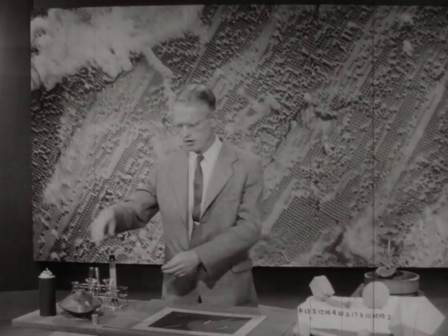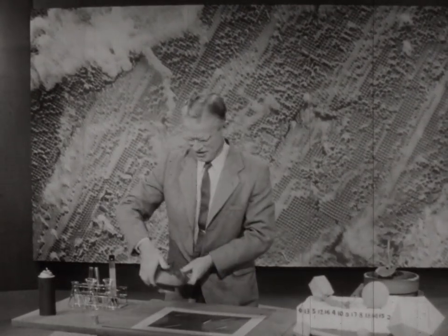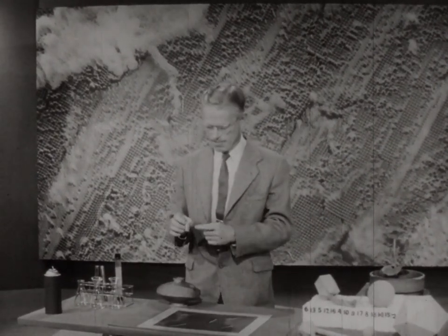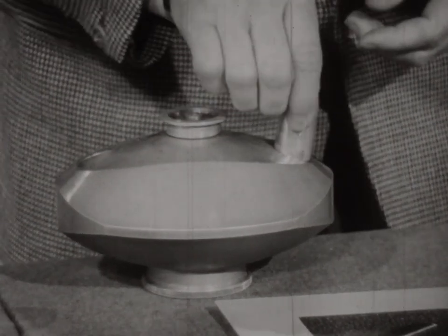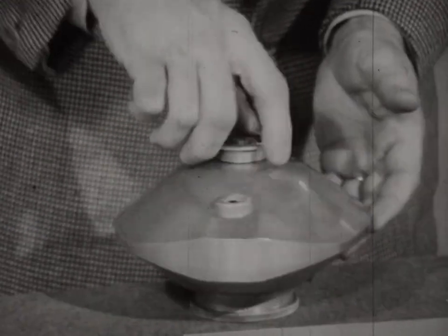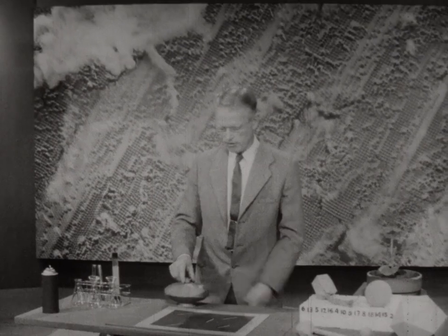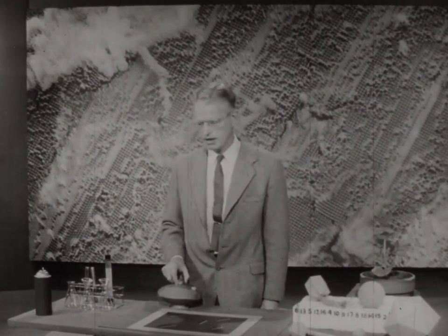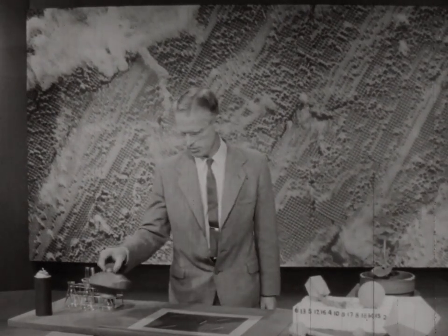We do this a little bit more precisely in the case of a centrifuge. Of course, we fill a small container that has glass in top and bottom with a virus solution and put this in what's called a rotor that goes in the centrifuge, and this spins rapidly, maybe 60,000 revolutions per minute. And we measure how fast the virus particles are flung down to the outside of this container. And in that way, we get an idea of the weights of these particles.